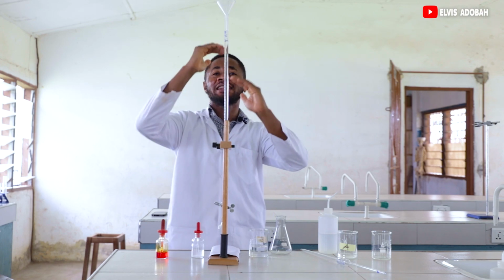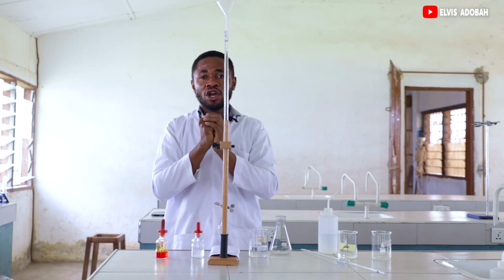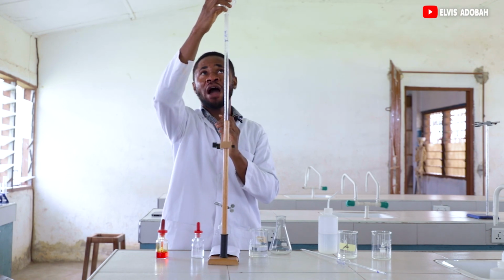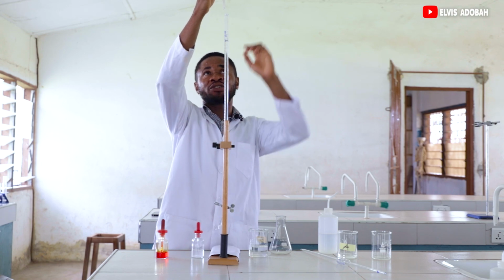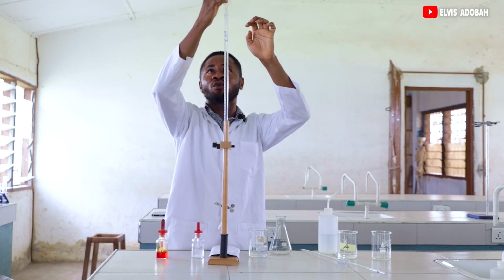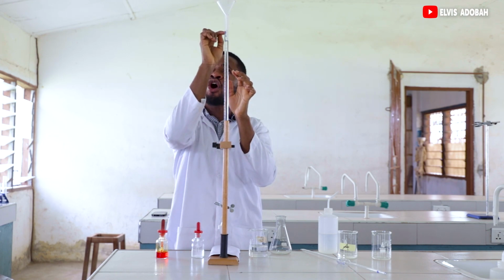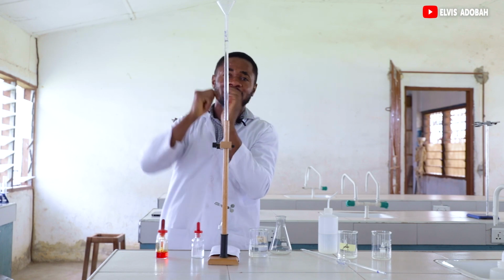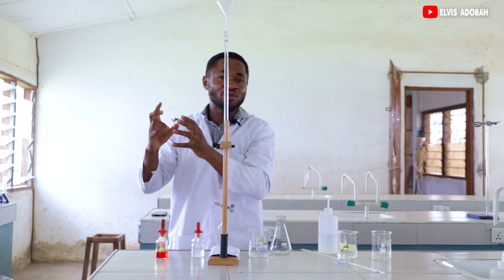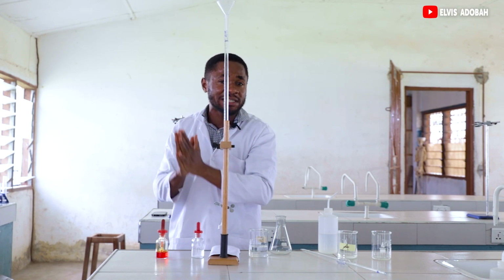So after pouring our acid into our burette, we have to adjust it to the 0th mark. And once again, we have to take off our funnel, because as you can see, there are a few drops of the acid over here. If the funnel is inside whilst I adjust, I might get to the 0th mark, but that small amount will release and add to the solution, increasing its volume. Remember, this is volumetric analysis. We are measuring volumes, and it's a form of quantitative analysis.